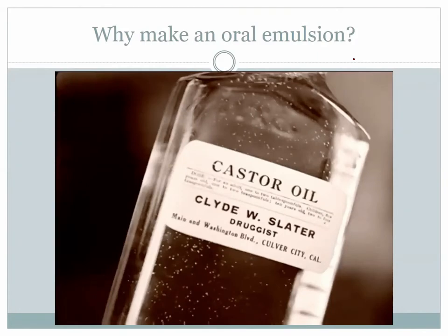We're going to be doing an oral emulsion. An emulsion is essentially when you mix an oil and a water, right? You need to mix them together. So I thought the best way to illustrate why we're making your dry lab prescription is to look in your packet. The first prescription you have there for the dry lab is for, I don't want to mess up his name. Who was the patient's name? Sawyer, right? I think it was Sawyer. I'm flipping here. I'm not doing a good job. Mark Sawyer. I should remember that.